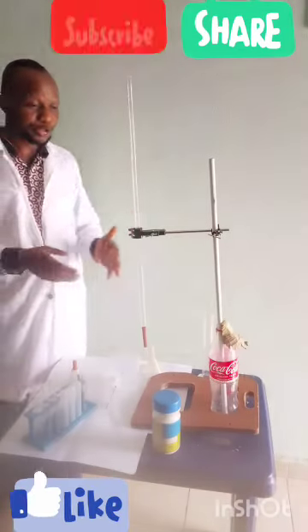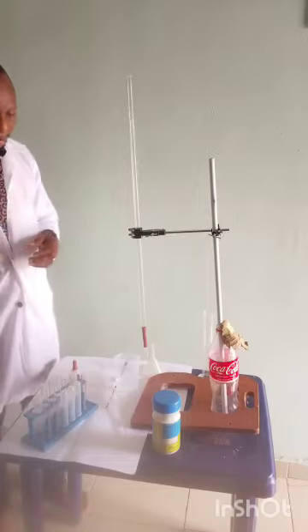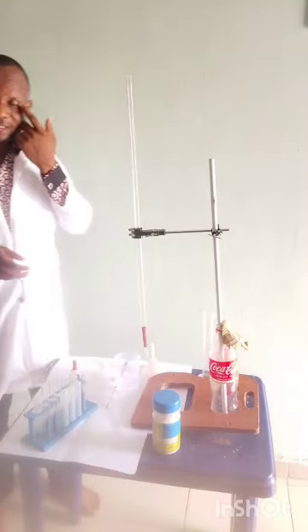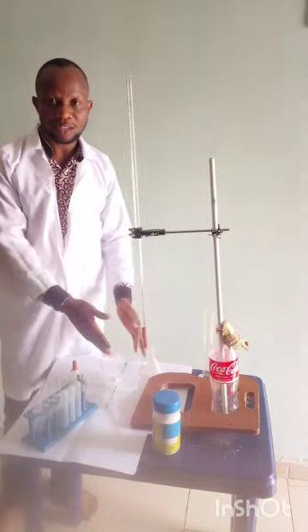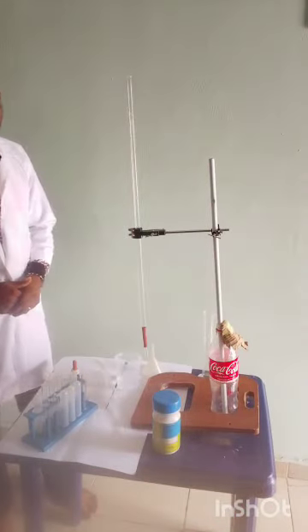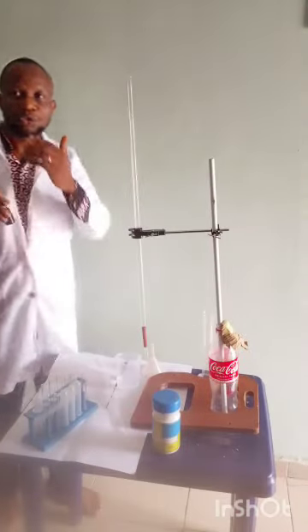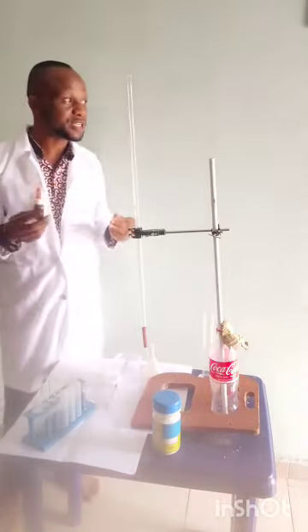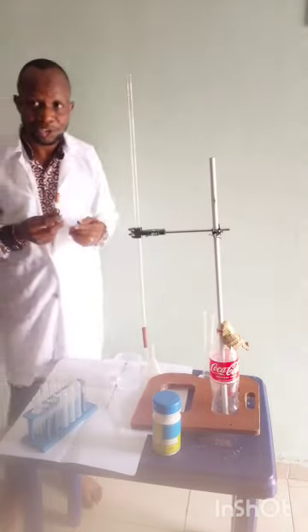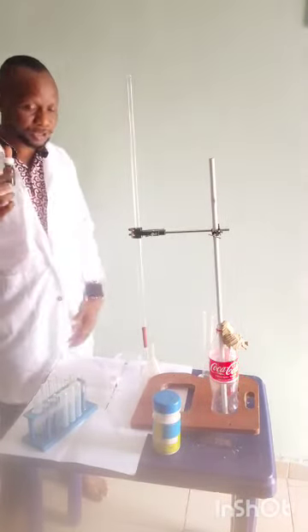Some parts of the titration. Here we have the burette, which holds the acid in most cases, or the titrant. The other solution is usually in the conical flask or the beaker. Then you have the indicator, which helps to determine the endpoint. In most cases, if it is an acid-base titration, we use phenolphthalein or methyl orange.